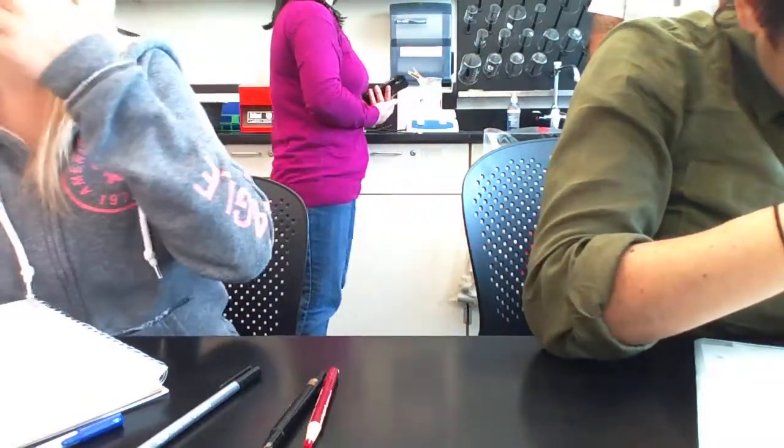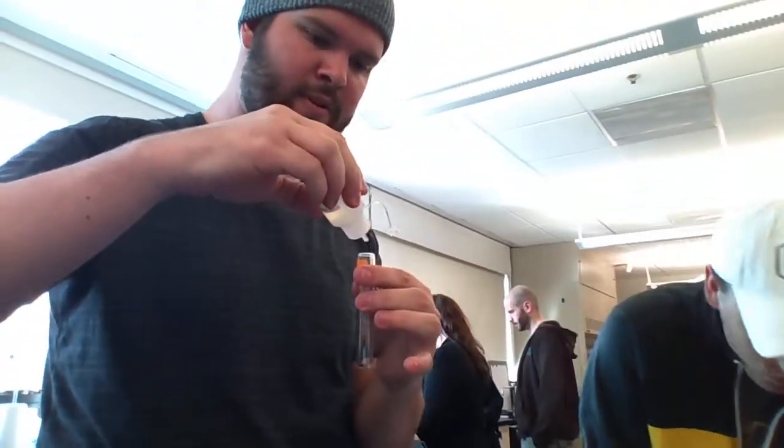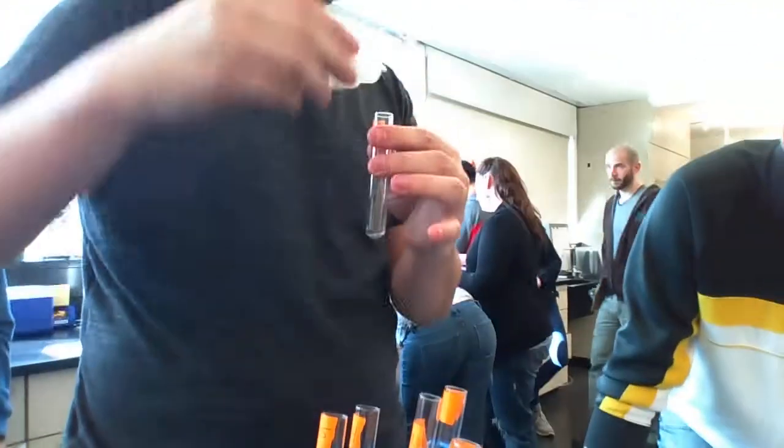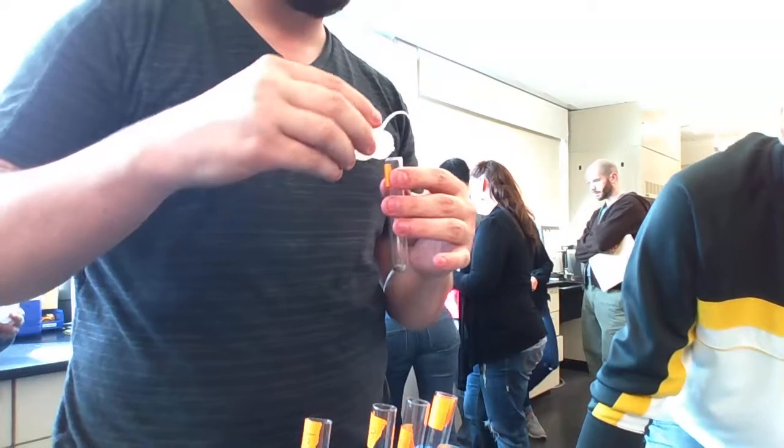Great. Oh wait, hang on, guys. What are we doing? So we're making moves. Tell them what you're doing. 5 drops in 3. Can you see it right now on the camera? Actually, you want 5 drops in everything but 2.